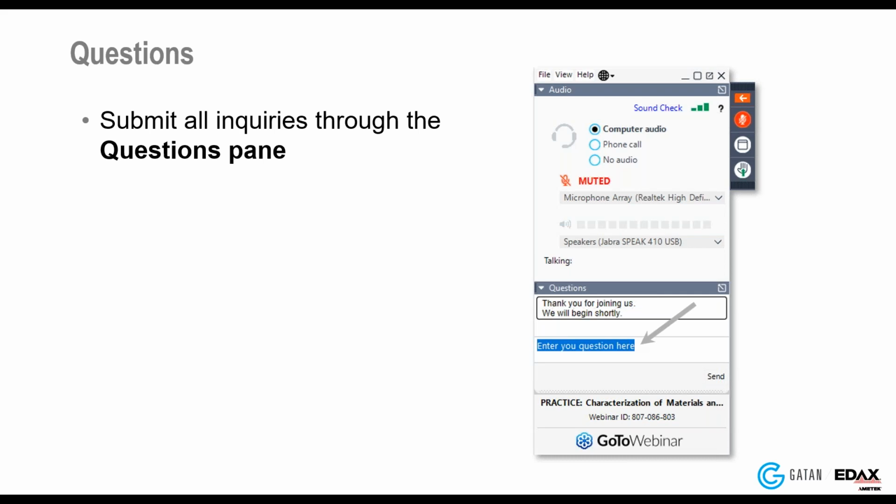Normally we would need some knowledge of the specimen in order to be able to apply the technique, either based on what we expect to be in your sample, or to use some kind of pre-characterization using EDS. That then allows us to perform Monte Carlo modeling to really select appropriate conditions to carry out the sequentially captured data. And actually, that's one of the important things about the software that we're developing to do this, is to ensure that you have proper registration between the data analysis points for the 2 different signals.